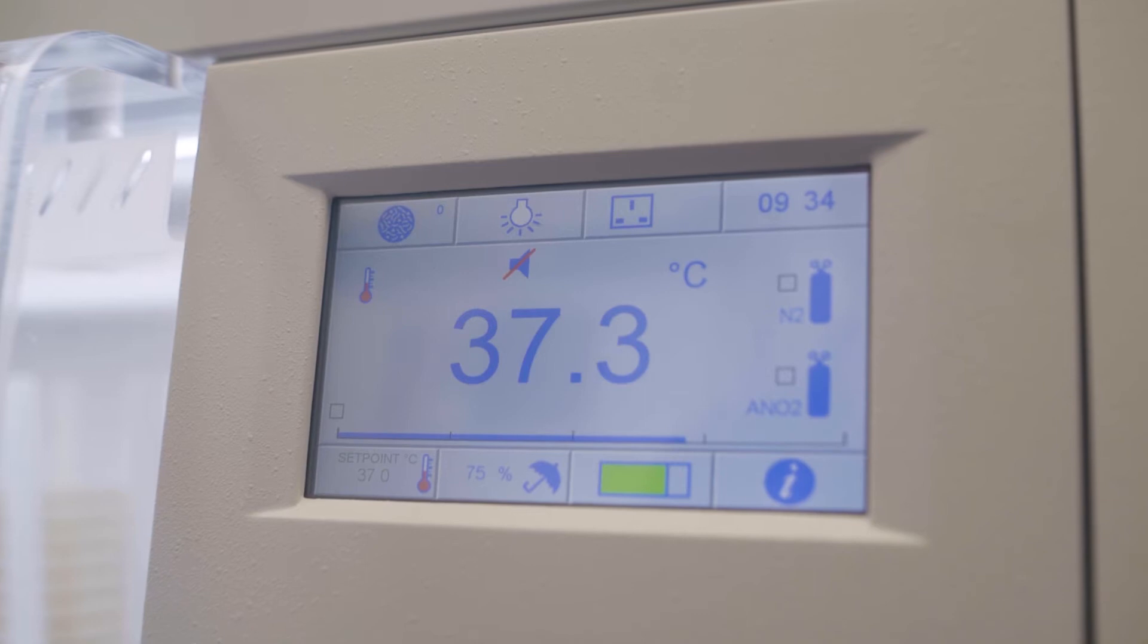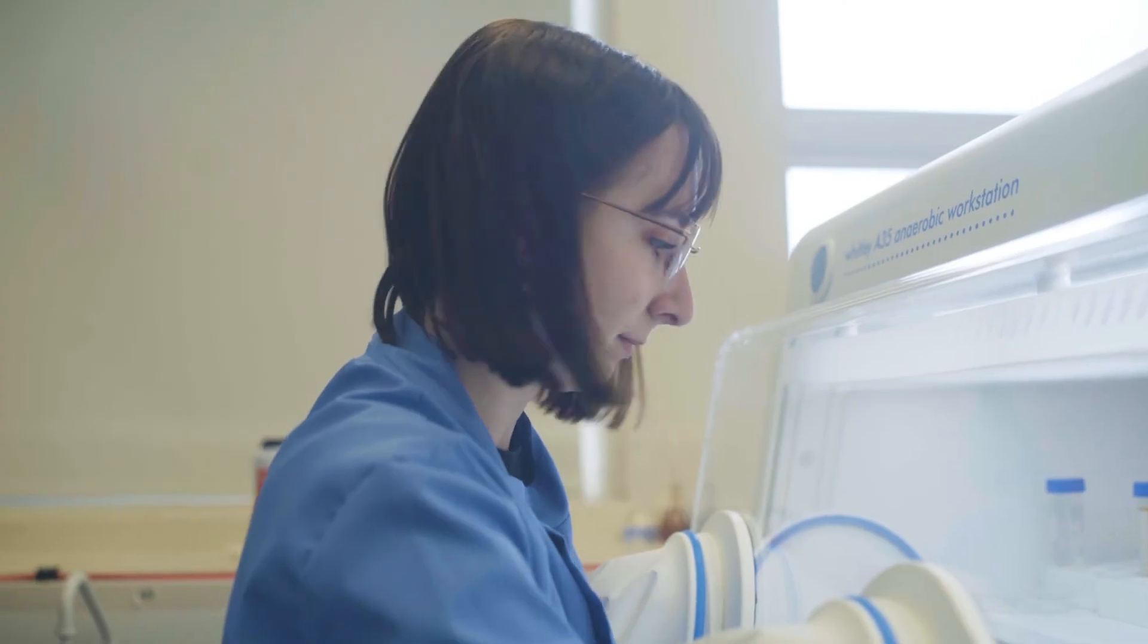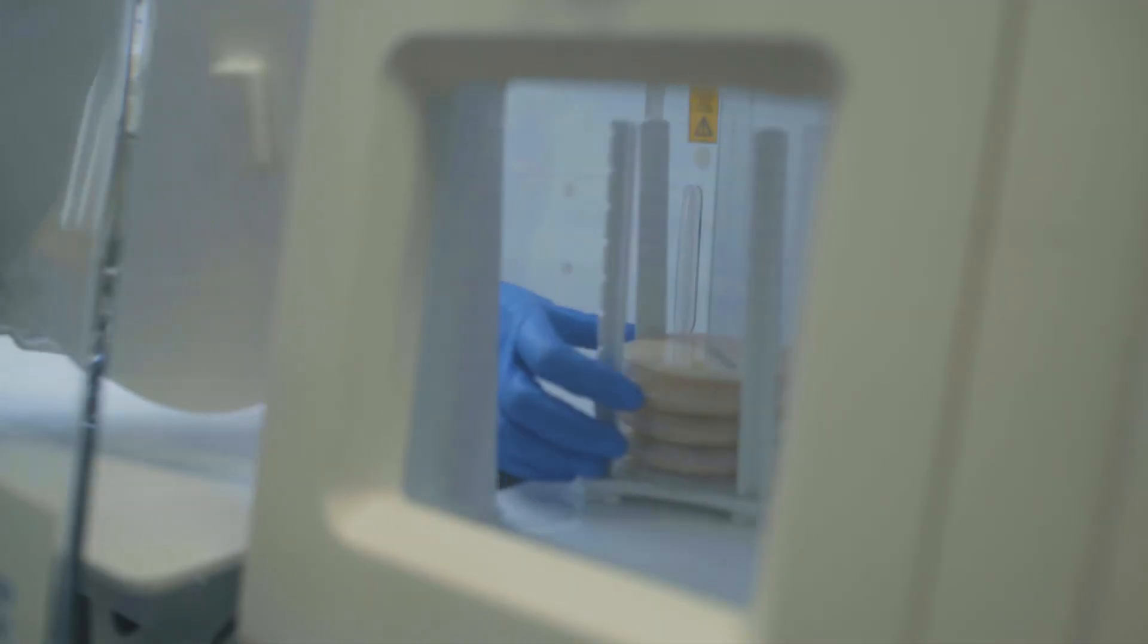A brilliant part of the cabinet is the catalyst monitoring system that allows us to double check whether the cabinet is working optimally. When the catalyst isn't working, the system flashes and enables us to change that catalyst.